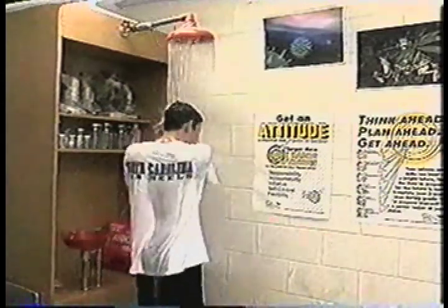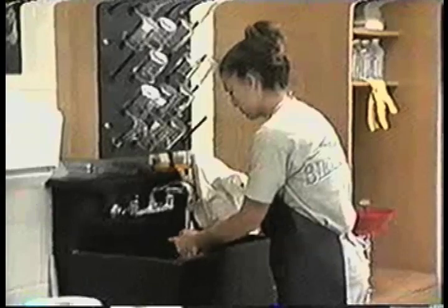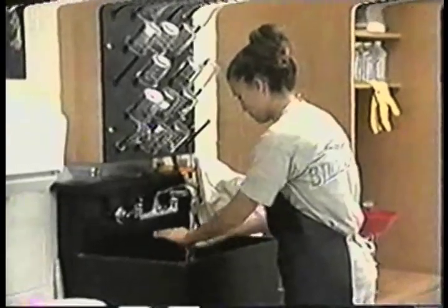It may be necessary to remove your contaminated clothing. Safety in this case comes before modesty. Whether fully clothed or not, it is important to begin the washing process immediately. This is not your normal shower. There's no soap, and the water has only one temperature, cold.